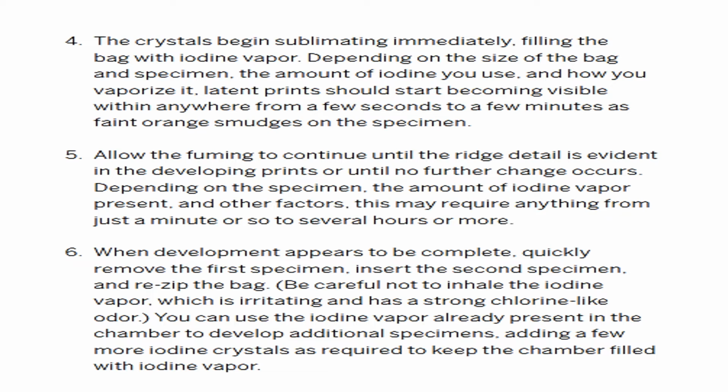Latent prints should start becoming visible within anywhere from a few seconds to a few minutes as faint orange smudges on the specimen. Depending upon the size of the bag and the specimen that we are having, we have to do the shaking.